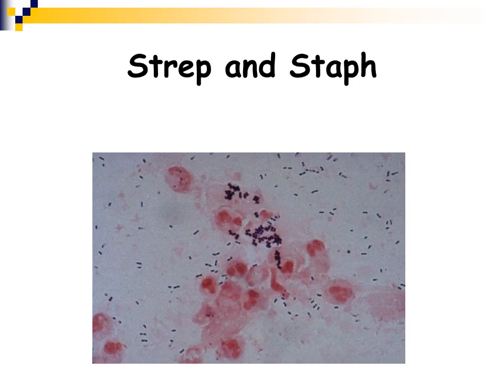Now here's a mixture of Streptococcus and Staphylococcus in a gram stained specimen. So in this specimen you can see some white blood cells, those pink large cells in the background, and you can see your nice Staphylococcus. They're a little bit bigger organisms right in the center of the slide here, and you can see them clustering together. All around the slide is Streptococcus, and to me it looks like a Streptococcus pneumoniae, a Diplococcus that's lancet shaped, and you can actually see a little halo of the capsule around it.